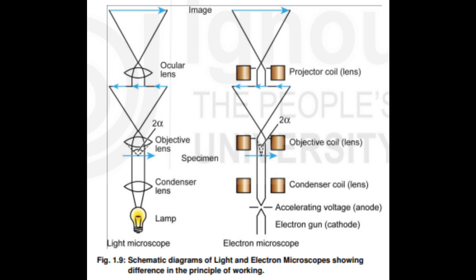The concept of electron microscopy was given by German physicist Ernst Ruska and the electrical engineer Max Knoll in 1931. The first functional electron microscope was made by E.F. Burton and his students C. Hall, J. Hillier and A. Prebus at the University of Toronto in 1938. Later in 1939, the first commercial TEM was developed by Siemens.